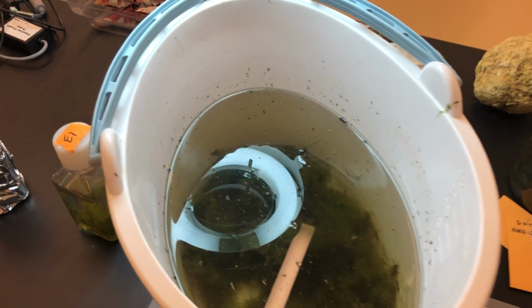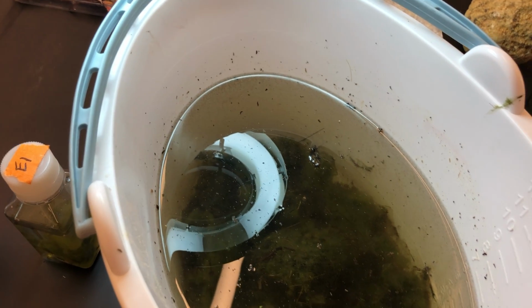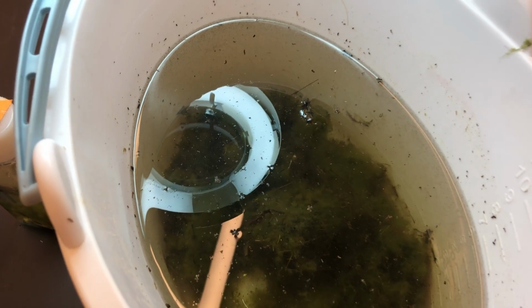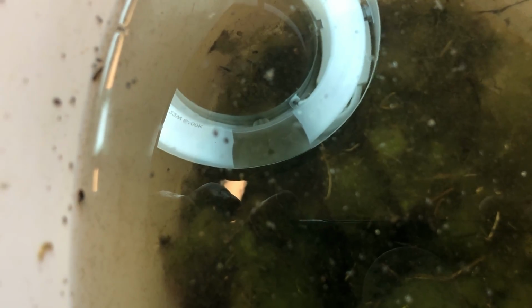Okay, here is my sample bucket of the material that I brought in from our pond back to the lab. I first wanted to show that even though I was only trying to collect the algae, although I wasn't screening it or trying to keep other things out, when I look at this ecosystem inside of this sample, it's actually extremely vibrant.